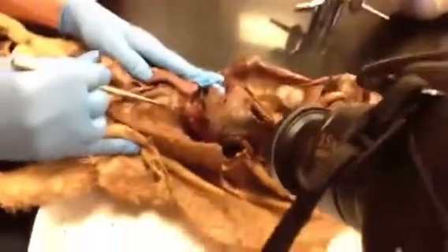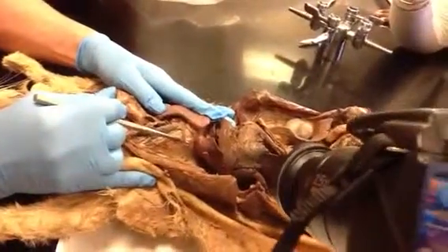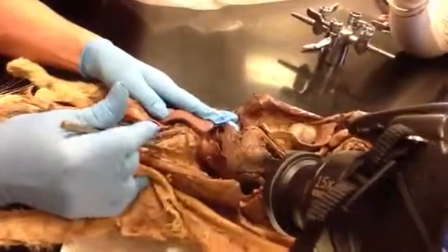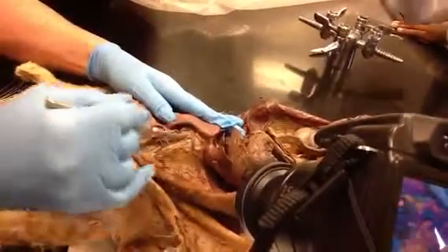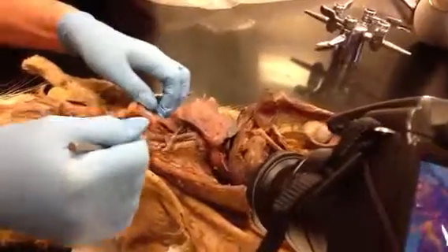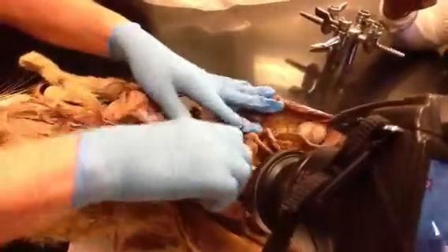So what am I doing? I'm shifting the heart over to the left side. I'm looking for something that's going to drop down and drain the thorax. So that is a azygos. Now, let's take a look at what you would see.